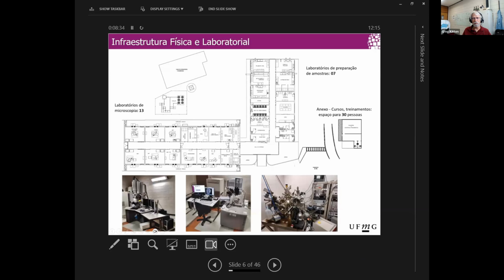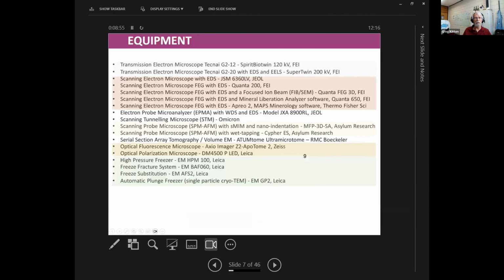These were 2 of the new microscopes when we originally opened and got the project funded. And then other microscopes. This is a scanning tunneling microscope, which came from Hewlett-Packard. People that were working there had contacts, and they said, you can have it if you bring it to Brazil. So we packed it up and brought it to Brazil. So we have lots and lots of equipment.